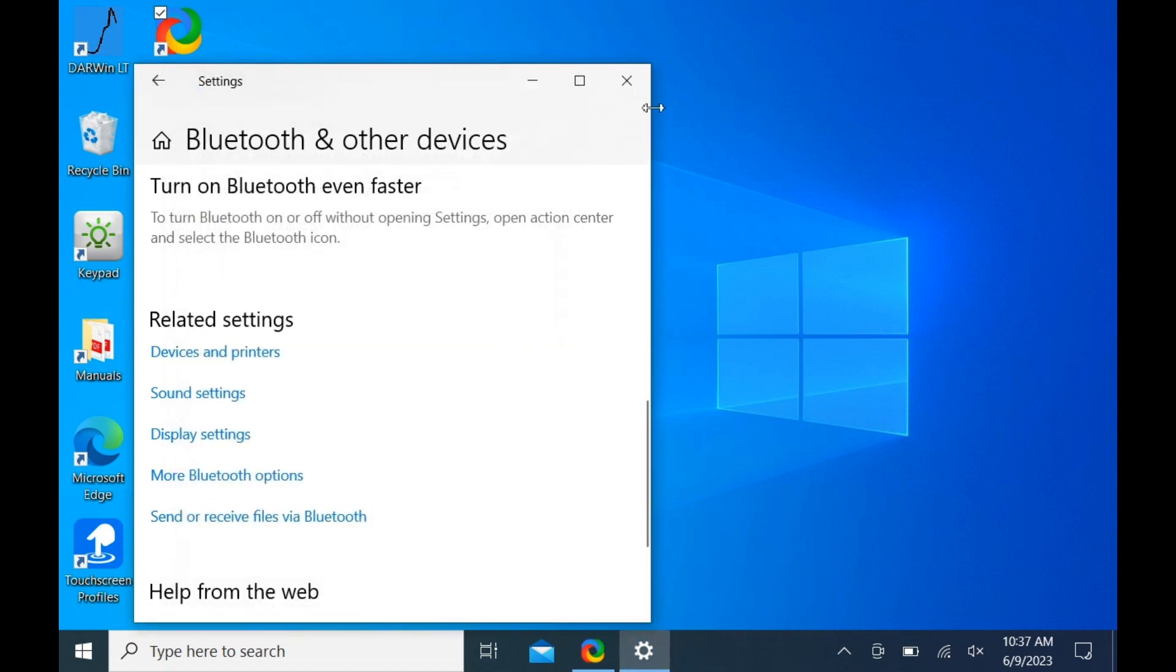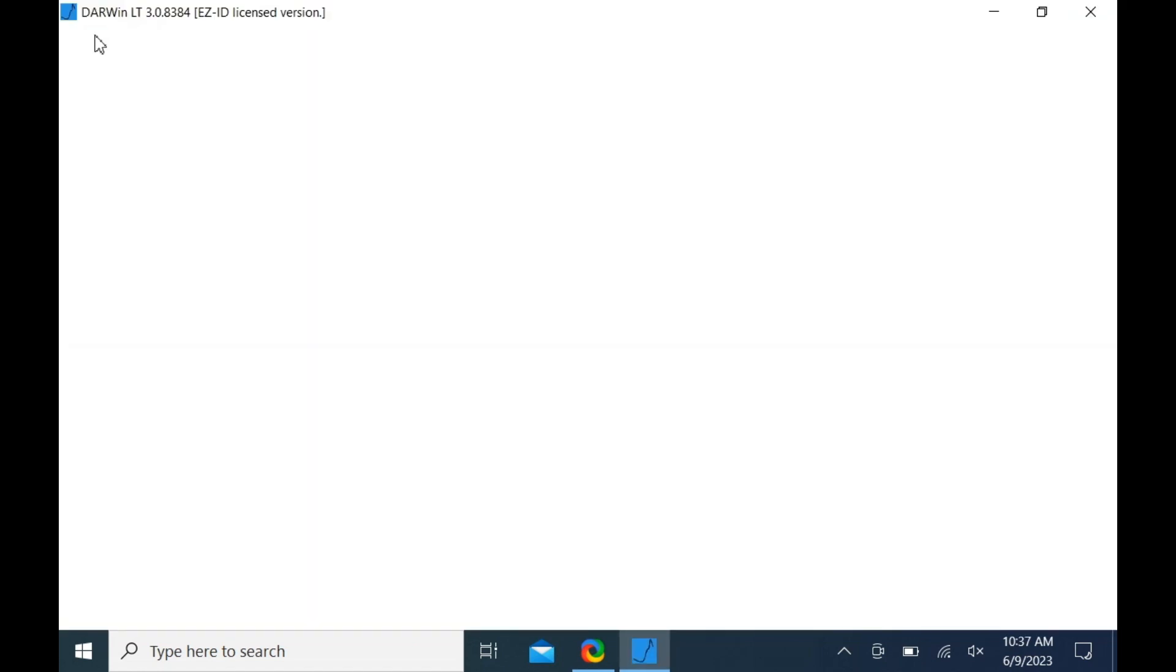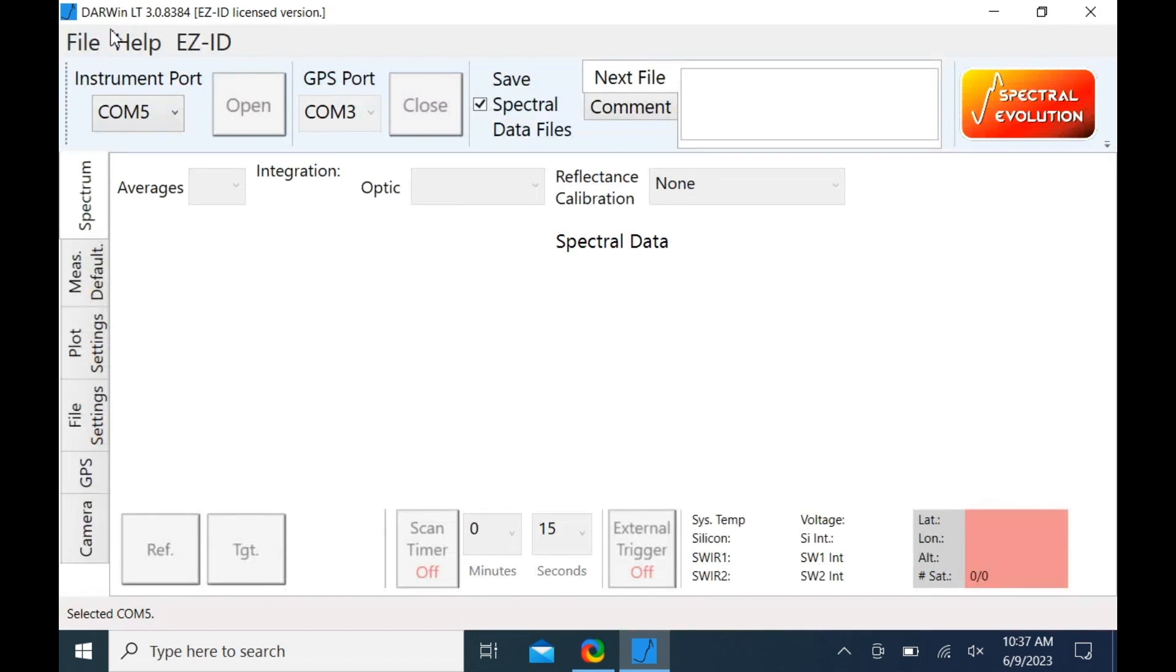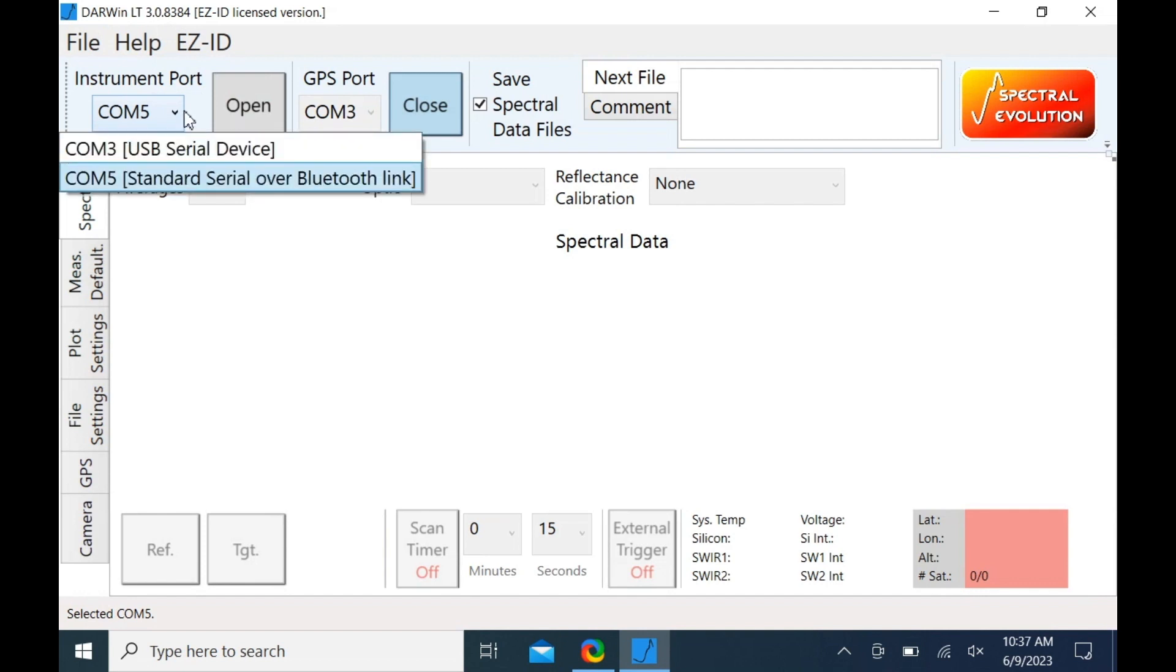Then open Darwin LT. In the instrument port drop down menu, select the COM port associated with your system and click open.